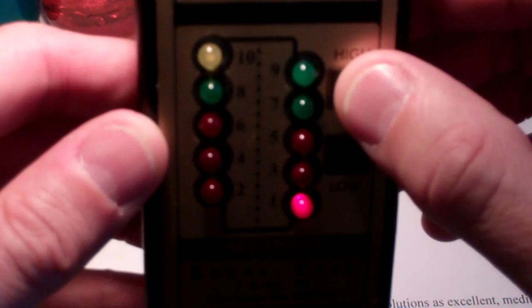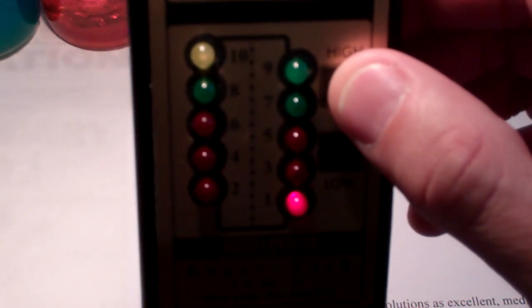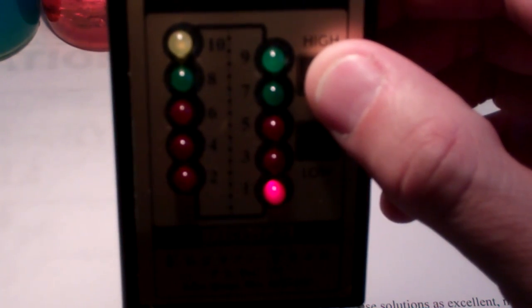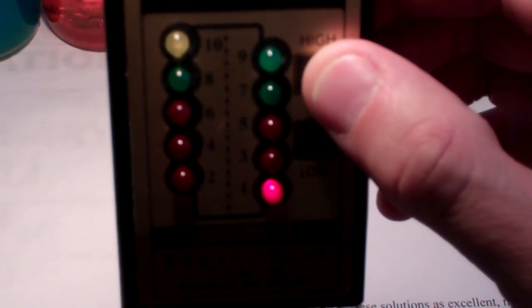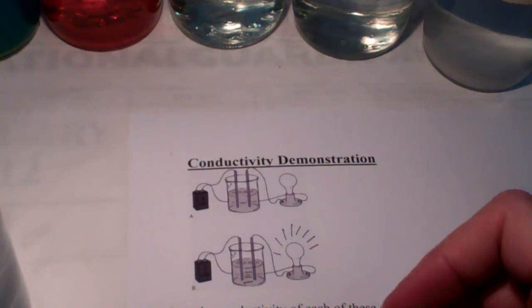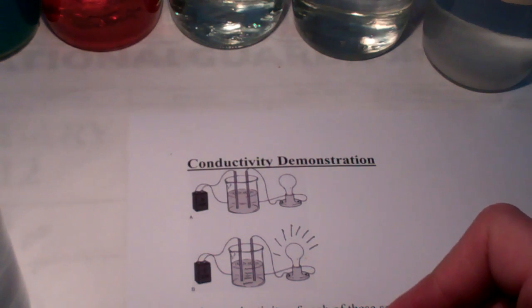So, now I'll press the high button, and you can see the number one lights up. Now, since I've pressed the high button, we're going to multiply that by ten. So, we're going to say that conducts at a conductivity level of ten. We won't use any units here. So, for distilled water, it does conduct on our conductivity meter at ten units.